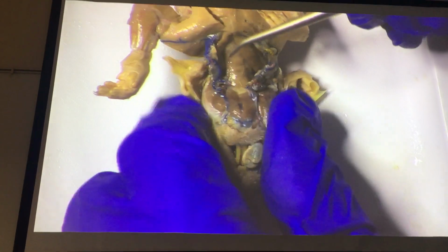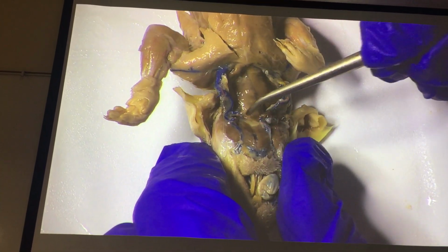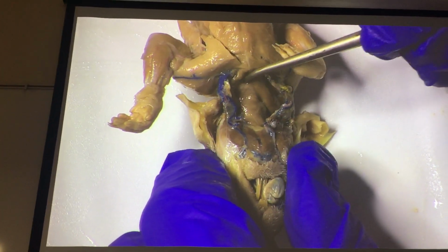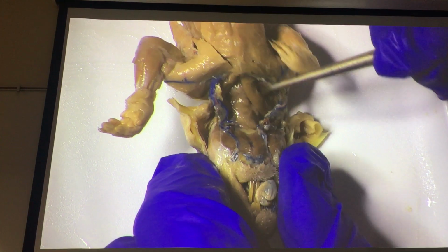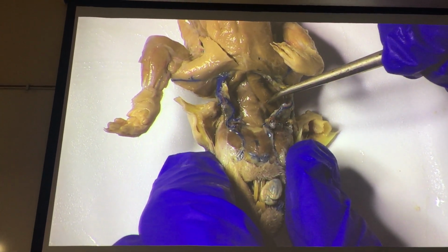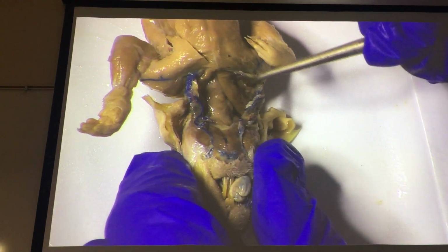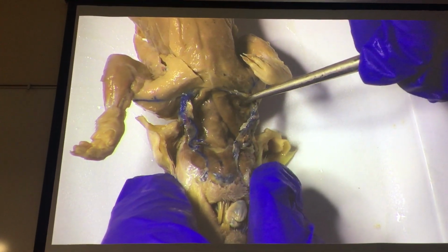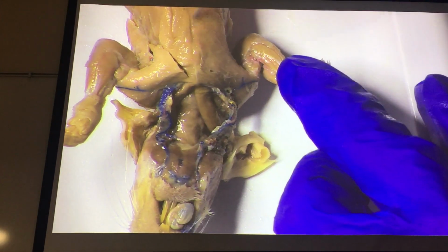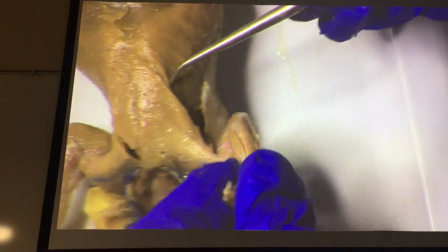Right along the midline here, we have a pair of muscles that run from the manubrium up to the hyoid, sternohyoids. Here next to them, we have a V-shaped arrangement of muscles running from the manubrium to the mastoid of the skull, called sternomastoid. Now to the side, we have this muscle here, which is the clavotrapezius.